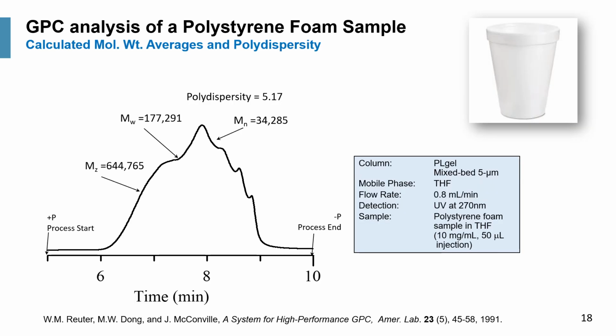Shown here is a GPC analysis of a polystyrene foam sample. Some of you might be familiar with these disposable coffee cups using polystyrene. These are made from a polystyrene foam. And this is using a mixed bed 5 micron gel column.